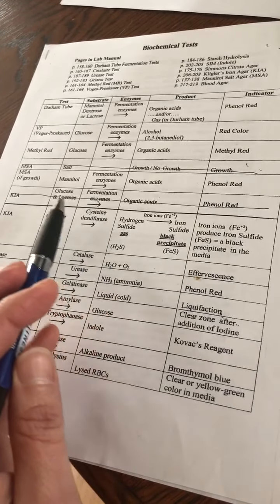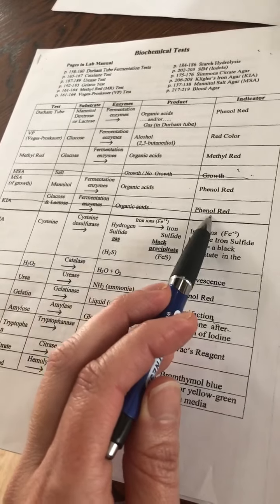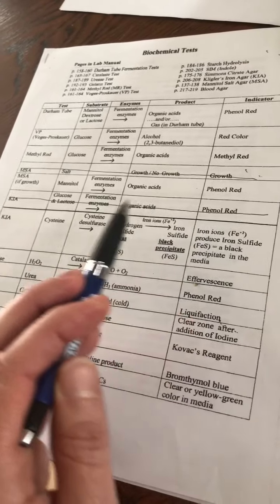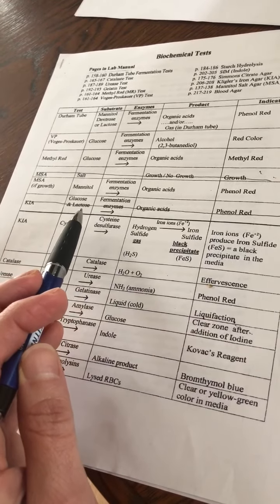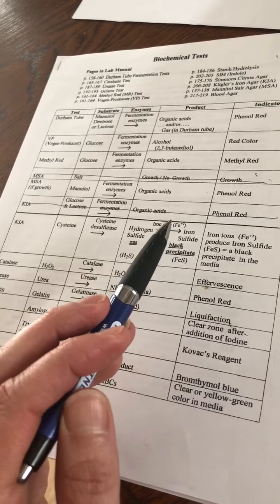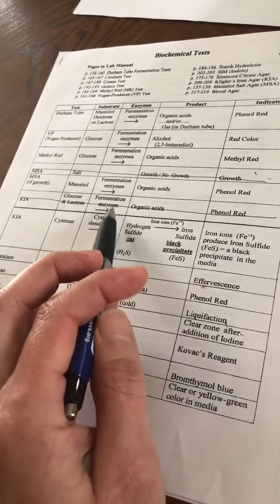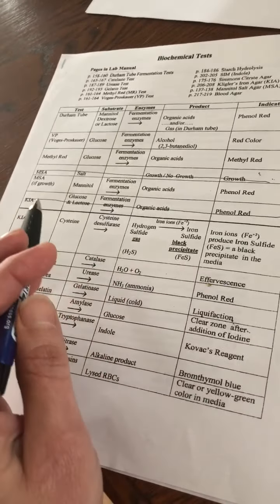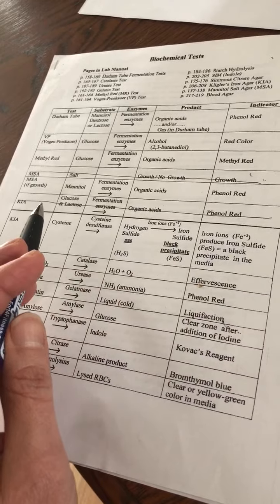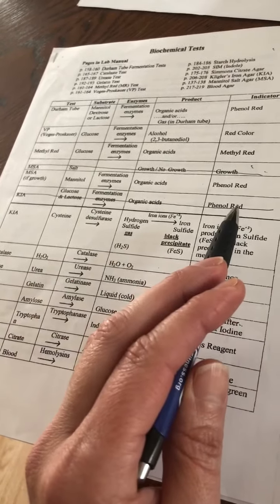Some of your bacteria would have grown and changed the media a couple of different colors because there's phenol red in that media as well as those iron ions. And if your bacteria could ferment the glucose or the lactose, it would have created organic acids and turned your test tubes yellow or half yellow and half magenta or all magenta, depending on whether it could ferment those sugars or not. But we didn't see that in the two test tubes that I grew. And it's not something that we would have tested with your unknown anyway.